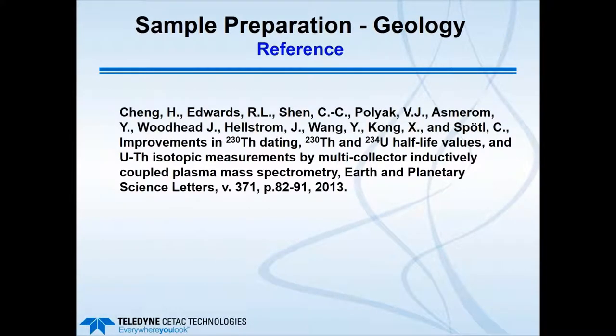So I do want to also give you a reference that you can also look up that describes this type of geochemistry experiment from Cheng et al. in Earth and Planetary Science Letters. And that will go through many more details of the sample preparation and the measurements used with multi-collector ICP-MS to do this type of work on speleothem samples.